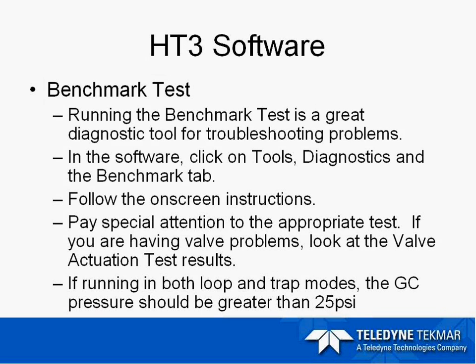A common problem with the benchmark test is if your GC pressure is not set up correctly. If you are running both loop and trap modes, the GC pressure should be greater than 25 PSI across the transfer line. If this pressure is not set up correctly, we typically see the bypass valve failing — and this would only apply if you have the dynamic option.